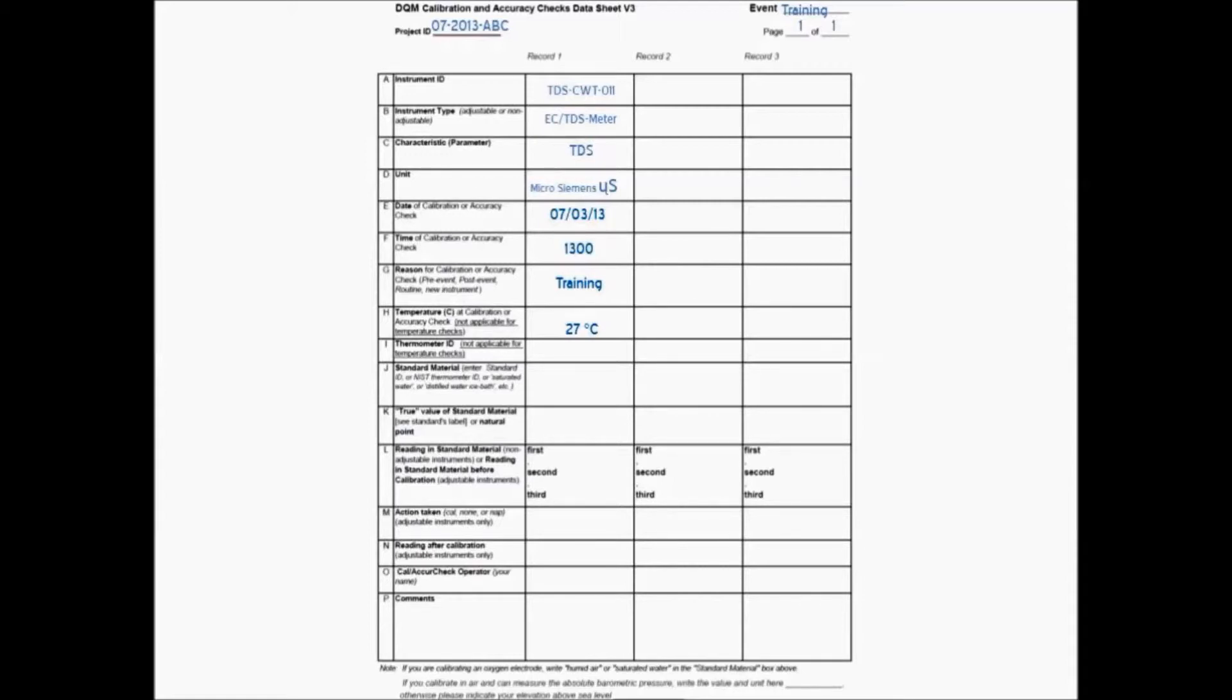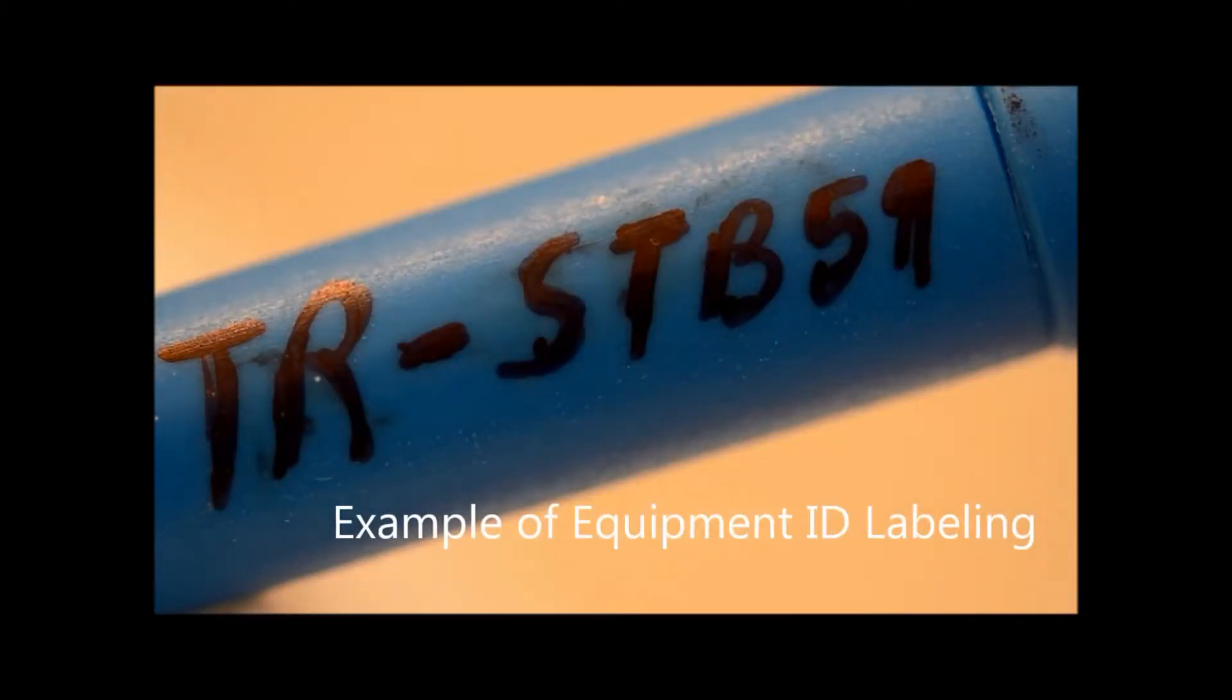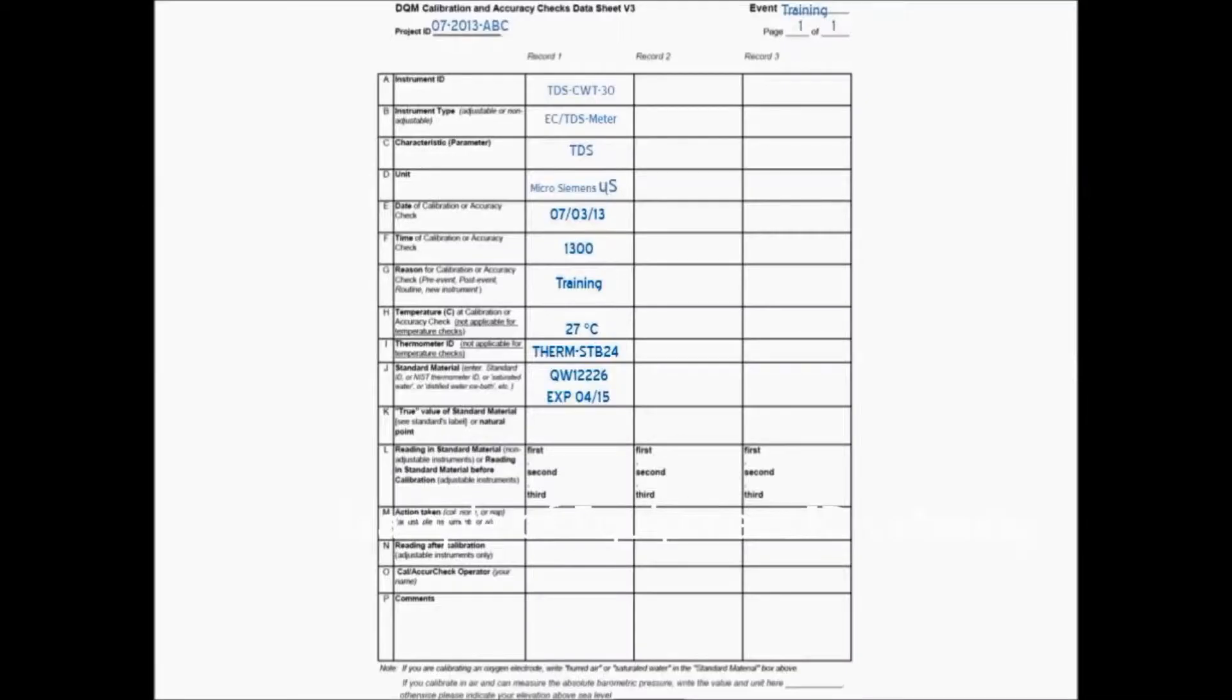On your bottle of calibration fluid, you'll find the value of the calibration standard, a tracking number or lot number, and an expiration date.